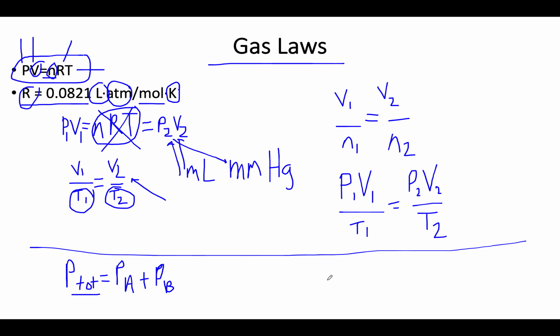So these are some of the equations you'll be using, and for sure the goal of the experiment is to calculate R. We're going to use this equation, but you'll see many equations in gases, and to calculate R we have to use this equation, so that's why I wanted to point this one out.